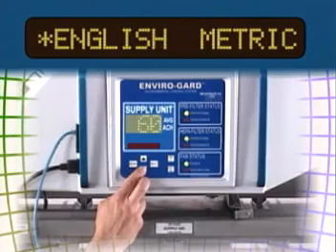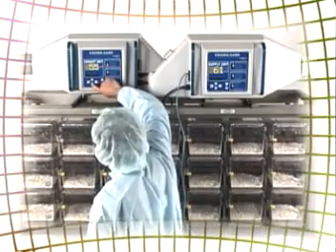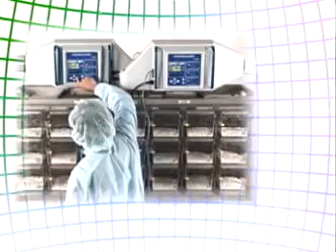All values may be viewed in either English or metric units. Status of the HEPA filter, pre-filter, and fan is constantly monitored and displayed with green and red lights.